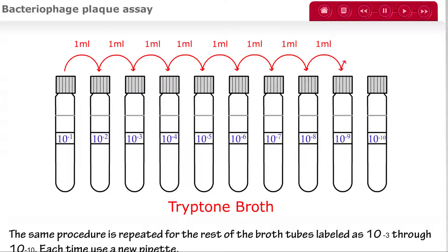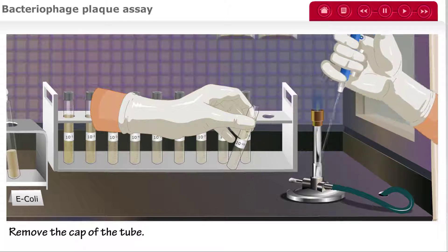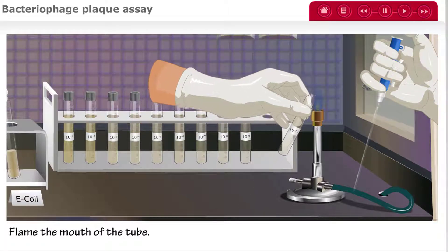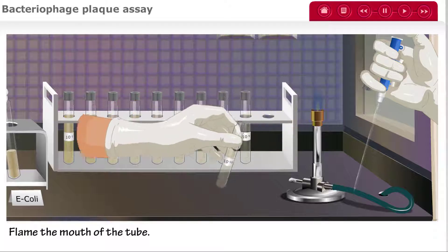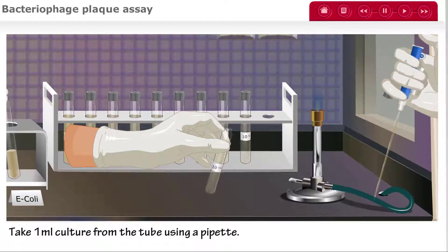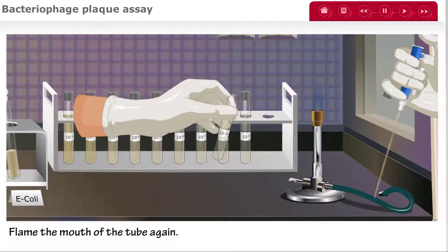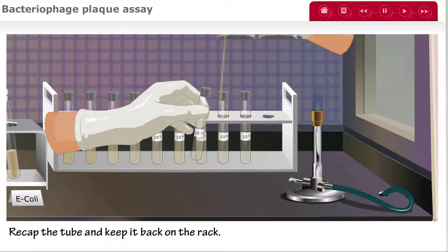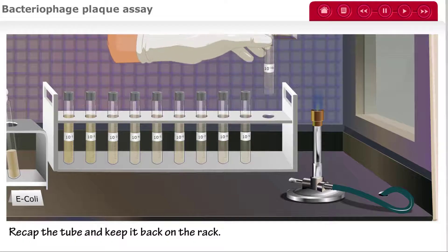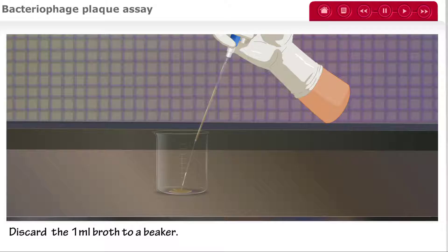The same procedure is repeated for the remaining tryptone broth tubes labeled 10 to the negative 3 through 10 to the negative 10. Each time, a new pipette is used. When done, remove the cap of the tube marked 10 to the negative 10, flame the mouth of the tube, and remove 1 mL of the culture using a sterile pipette. Flame the mouth and recap the tube before placing it back on the rack, then discard the 1 mL broth into a beaker.